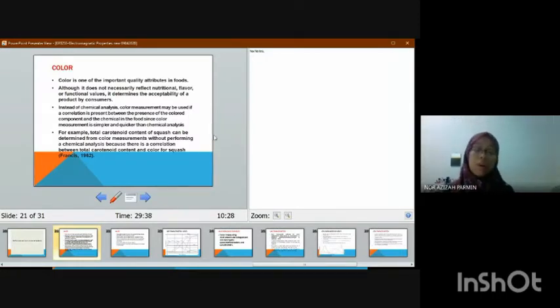Okay, so before we go to the color, so the color measuring equipment. Okay, tadi kalau kamu tengok, dia ada figure 4.2, effects of incident radiation. So IO initial, dia will be reflex. Okay. And if you see figure 4.8, rectilinear transmission. Okay. Yang ni kadar apa yang keluar melalui medium sama. Dia tak ada pencapahan pun. Maksudnya dia terus true je.